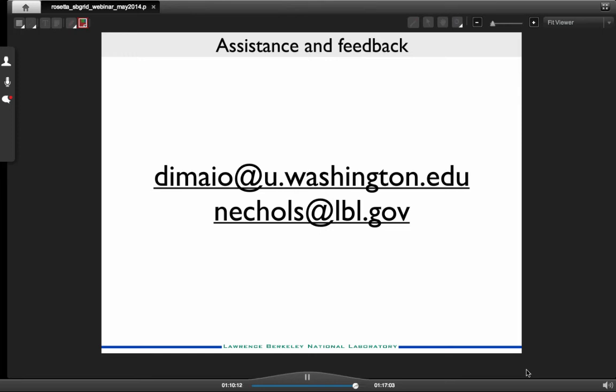Okay, and there's a question about the GUI, and is there a way to pass extra Rosetta flags through the GUI during the refinement process, or are your scripts pretty much static at this point? They're pretty much static at this point. I would say the intent was that the XML files would be the main interface for altering the Rosetta behavior, but it's actually quite easy for me to change it so it'll allow extra Rosetta flags. That's just a few lines of code that would need to change.